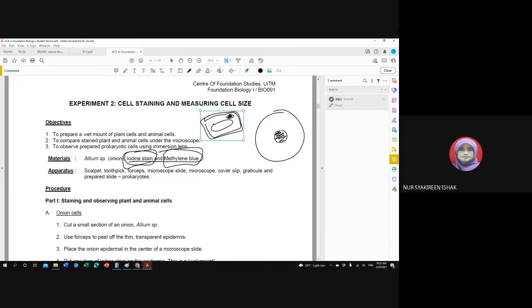The central vacuole cannot be seen very clearly, as it is an organelle that has a fine membrane, and it stores water to make sure that the cell is in turgid condition. So you cannot see it clearly like you see the nucleus. But you can see the effect of the central vacuole, with the nucleus of the plant cell pushed to the side.